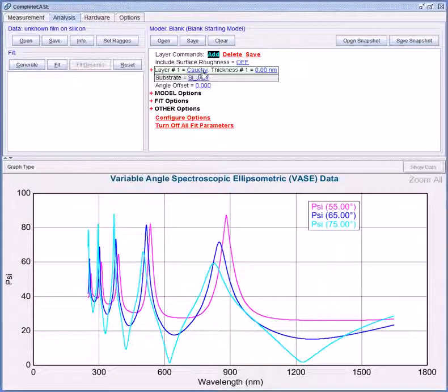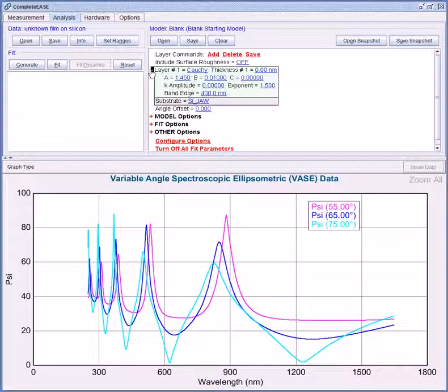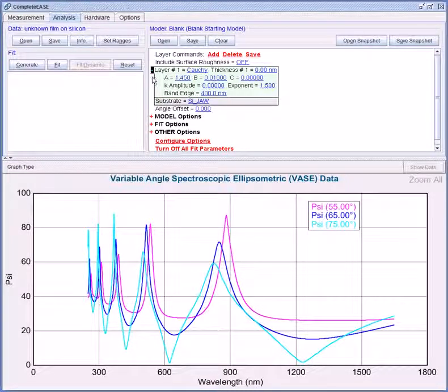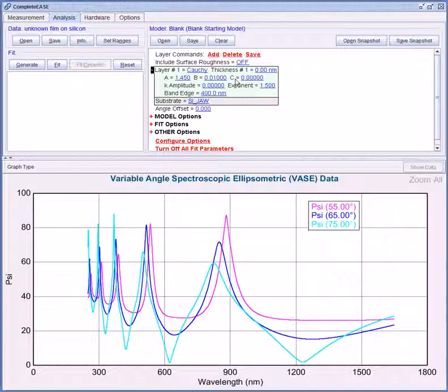After the Cauchy layer is entered you can click the plus sign to expand the layer. You'll see A, B, and C values. These are the Cauchy coefficients that are used to describe the shape of index versus wavelength.